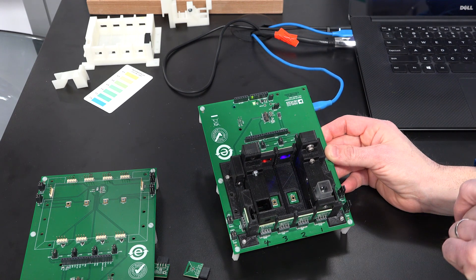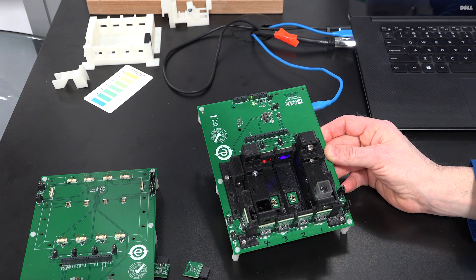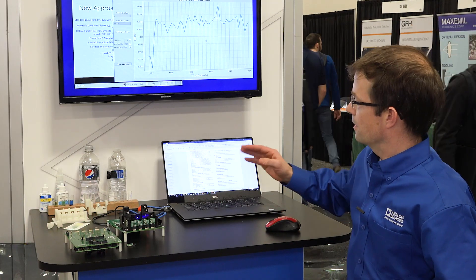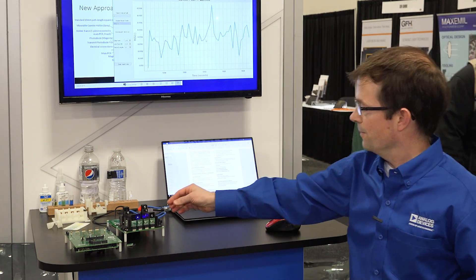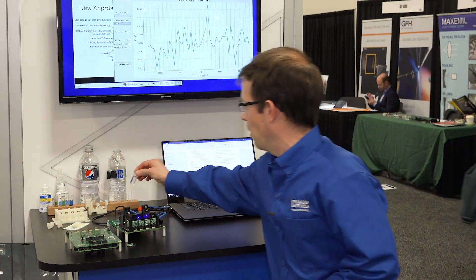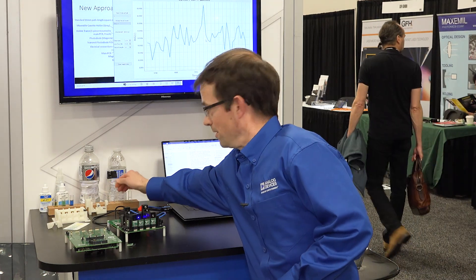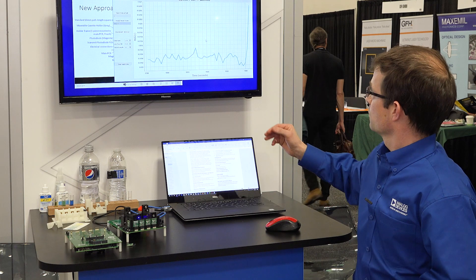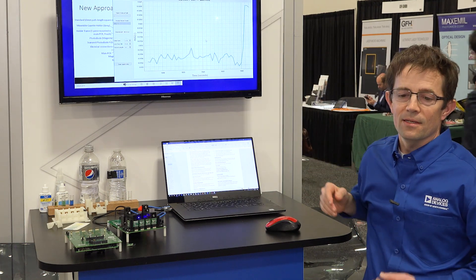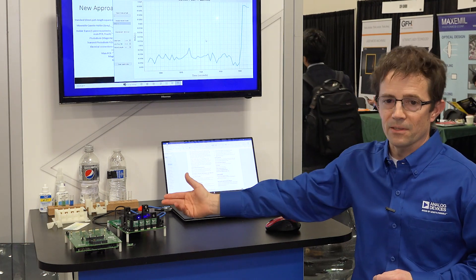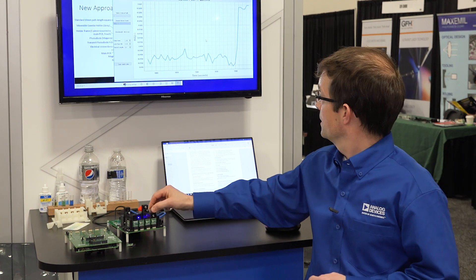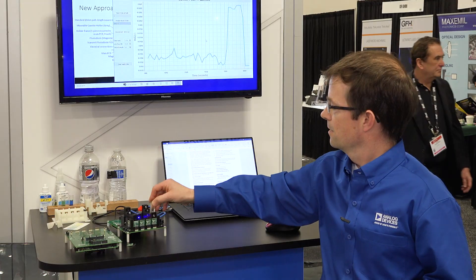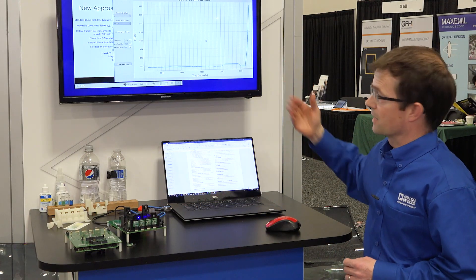That AFE stimulates LEDs and measures the return signal on up to eight photodiodes. Here we're showing fluorescence of quinine. Right now I have distilled water. I can put one drop of quinine, which is tonic water, into my distilled water and see the response. That is a very faint signal. And then if I go into 100% quinine, which is all tonic water, we can see that it's a very big change.